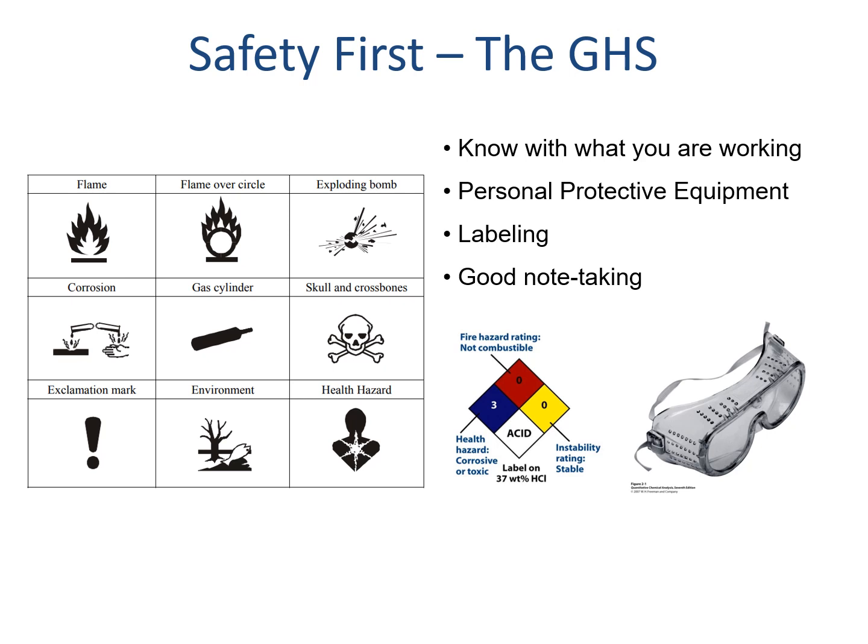The most common hazard label is flame, shown in the top left. The flame is an indicator of the inflammability of a substance. Most organic reagents have high flame ratings, so many of you have seen this before.